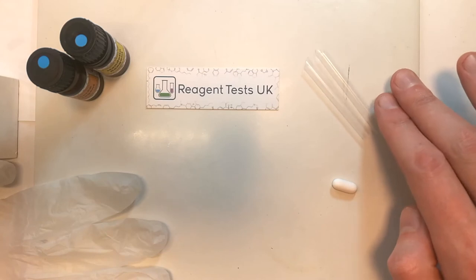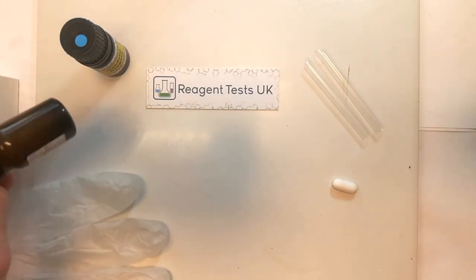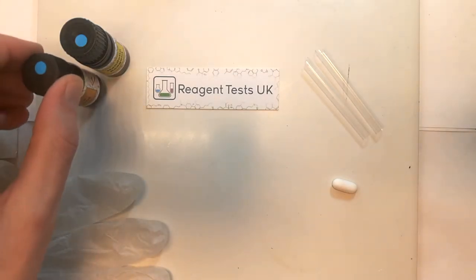You'll also need the small scoops that come with the test kit. These allow you to manipulate the test material that's inside of the bottles.